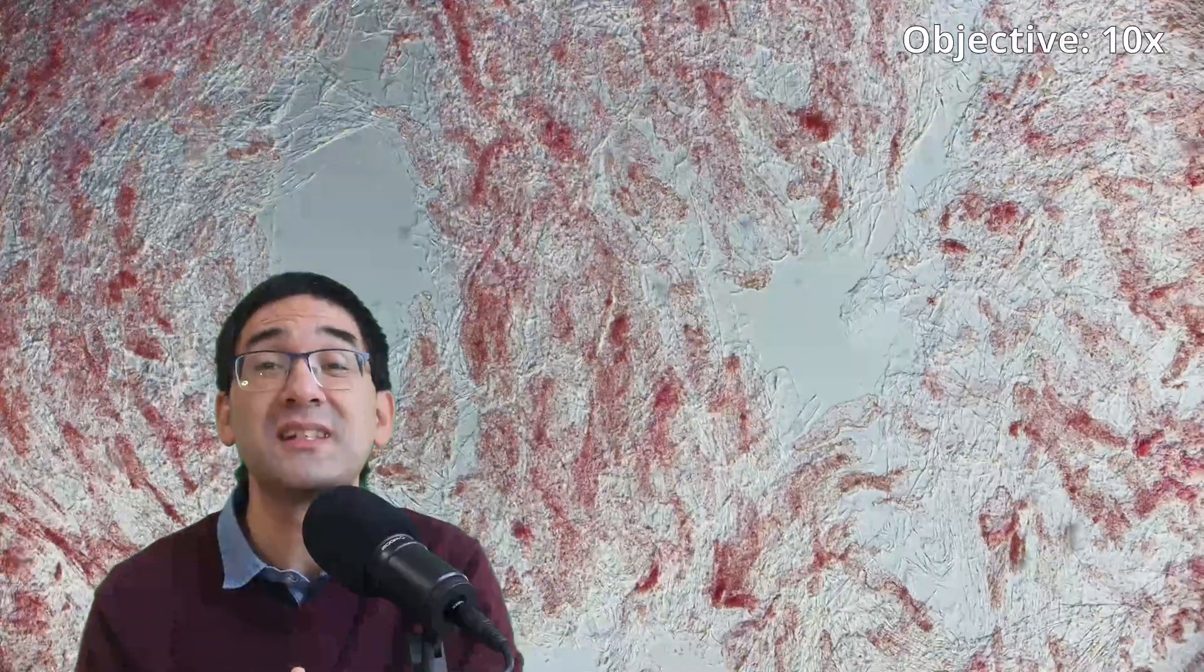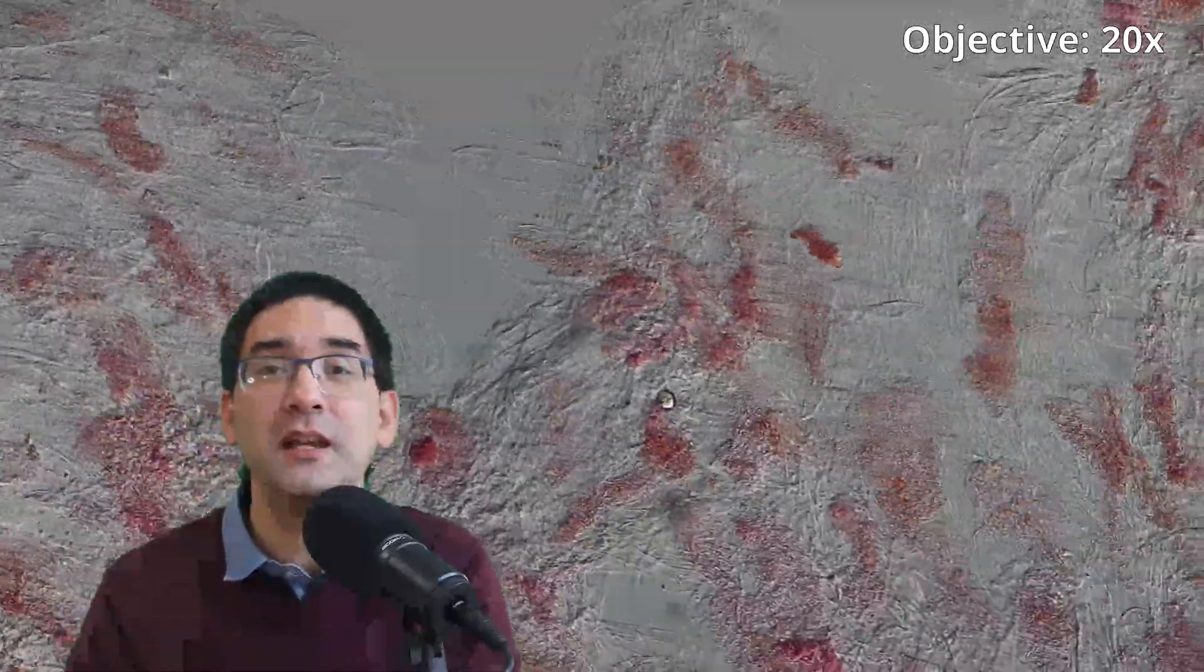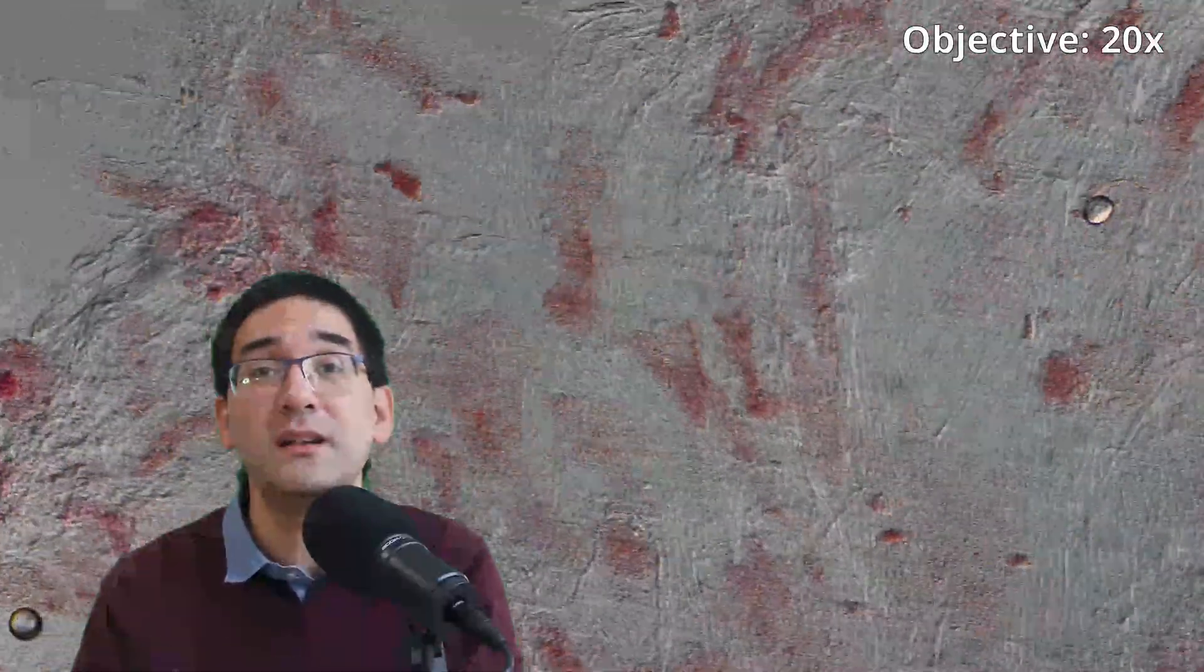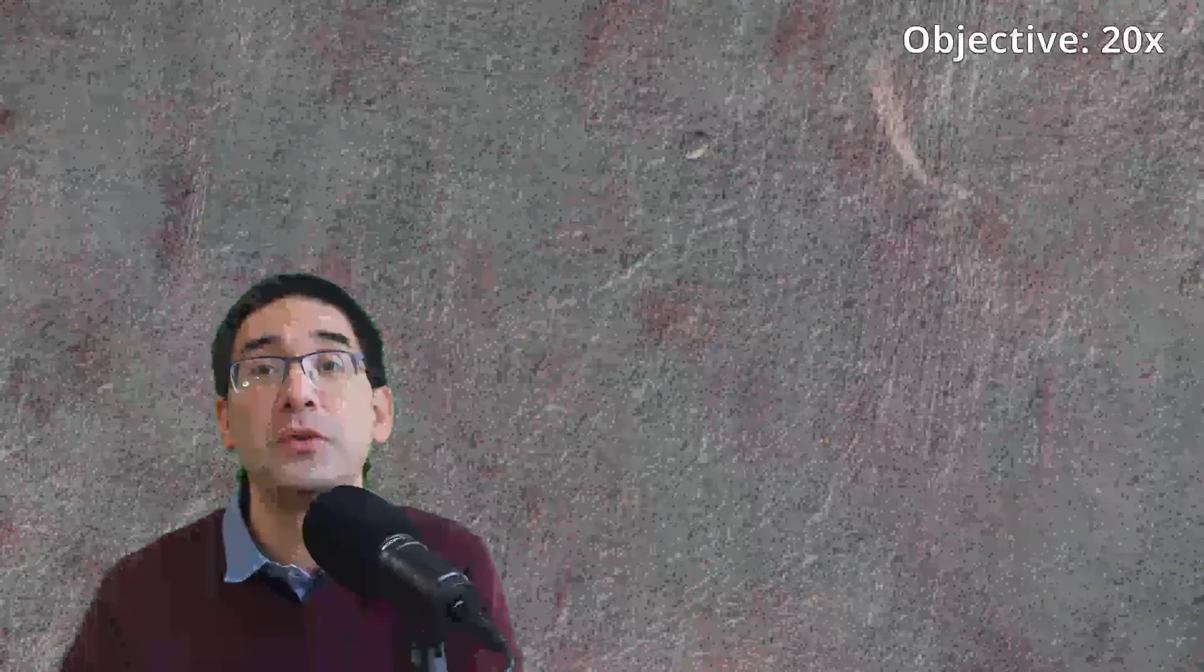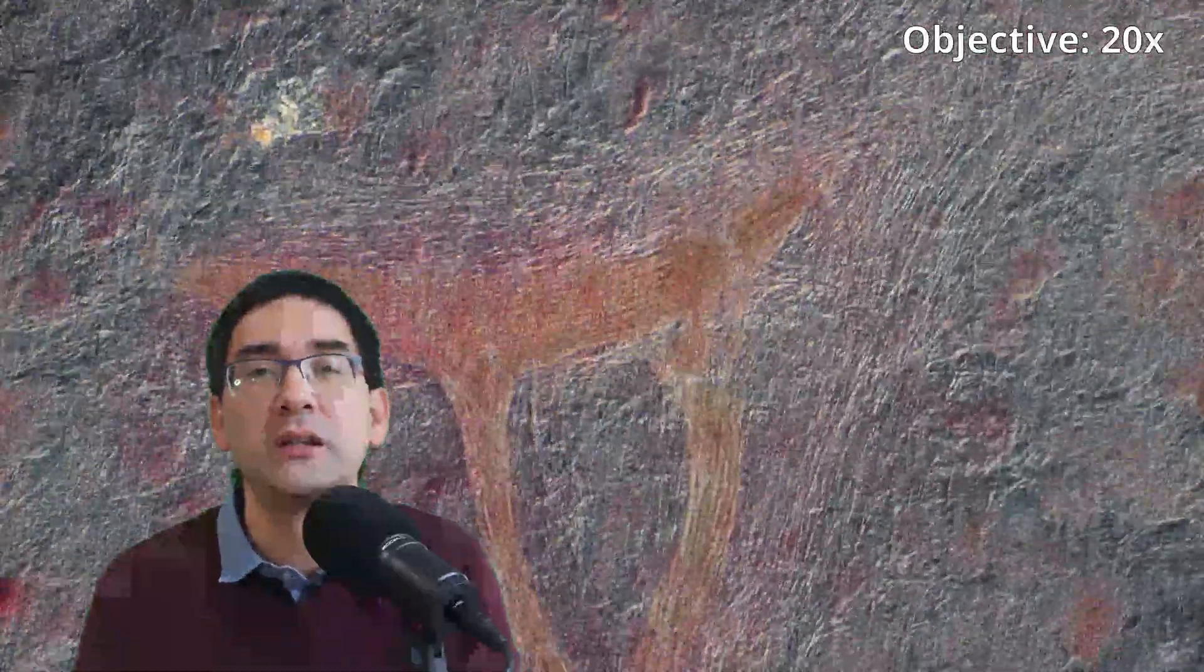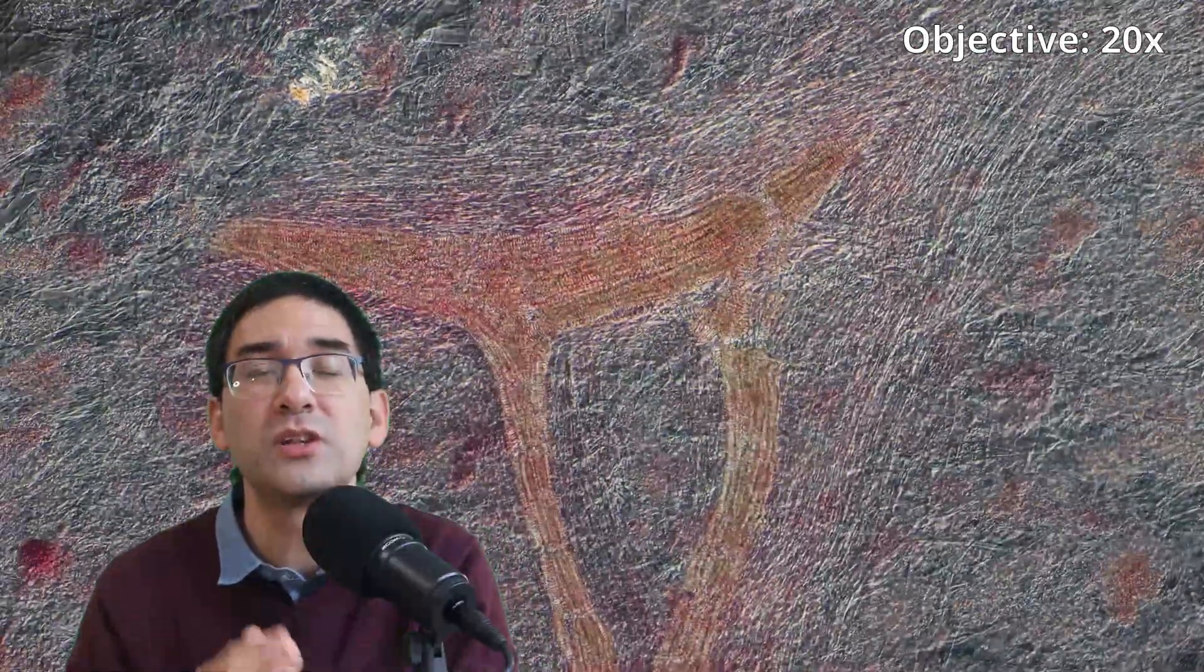Yeah, I did see that there were some structures there. Individual cells I could not see so well because it was all a little bit messed up, I have to say, because by squeezing the sample of course you're also destroying the original structure a little bit. But this is what I found then.